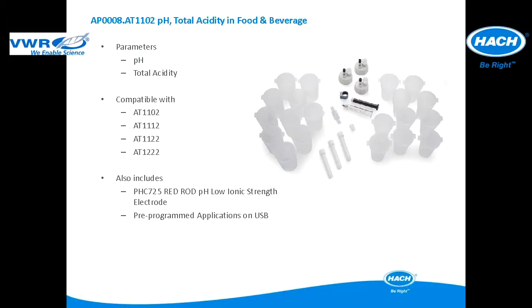This application package is used for pH and total acidity in food and beverage applications. The application package is compatible with the AT1112, AT1122, and AT1222. It includes all of the items pictured and a pHC725 red rod low ionic strength pH electrode. The pre-programmed applications are included in a USB application key.